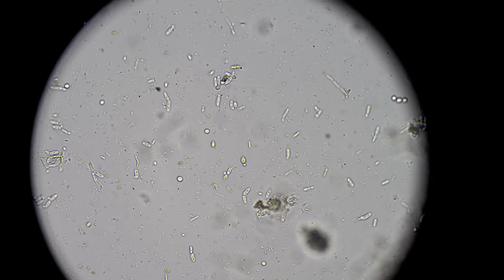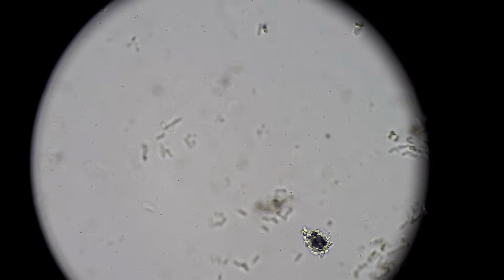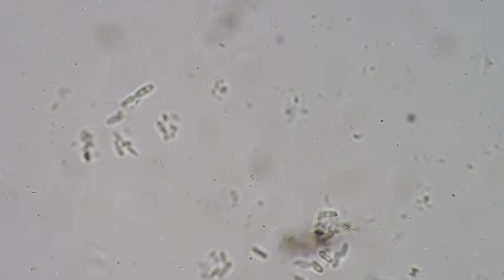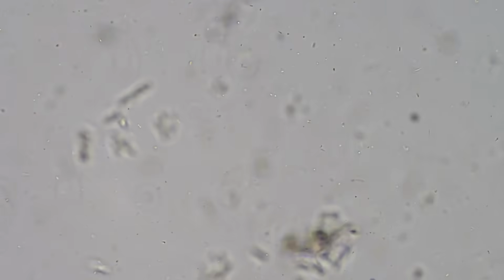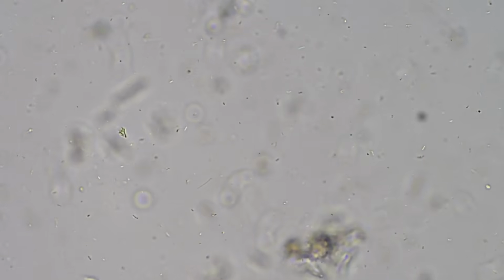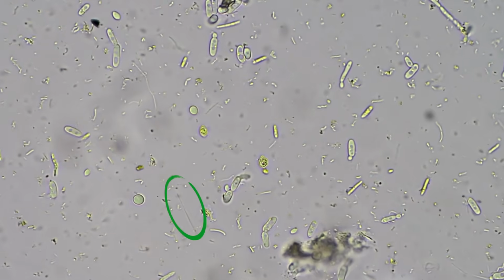So let's actually go up and down. This is the bottom of the slide right here. But if we go up, we can see the drop itself is just filled. So we're traveling through the drop. You can see all that bacteria. It's like snow. See that? There's spheres and there's rods. That's the bacteria. And some of these rods are really long. And those are lactobacillus.